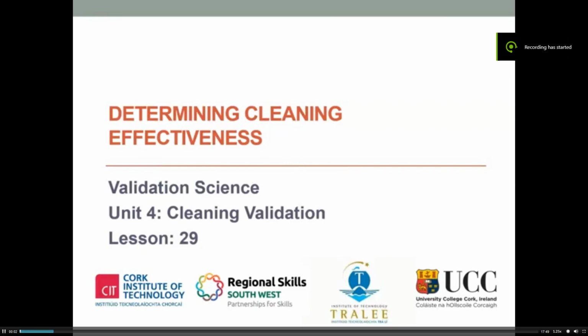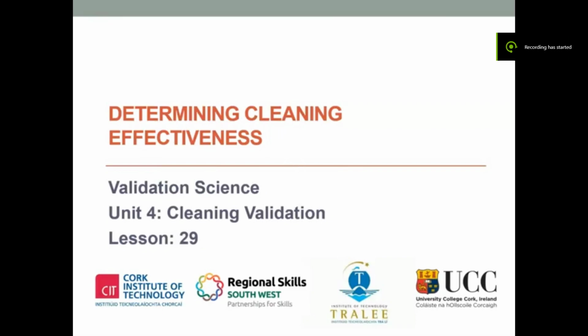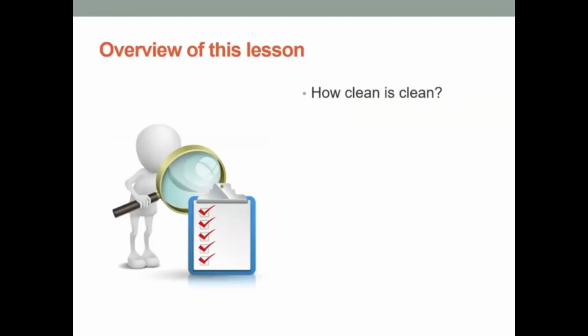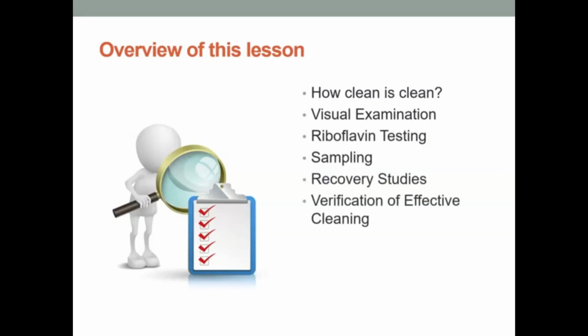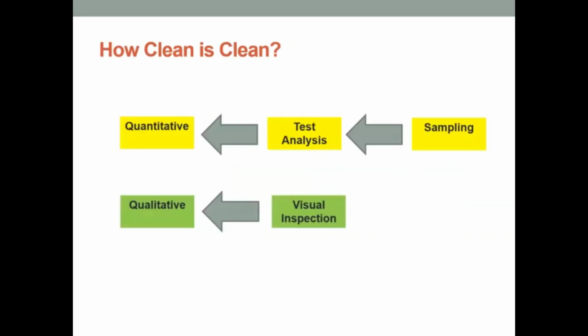Welcome to lesson 29, Determining Cleaning Effectiveness. In this lesson, we are going to be looking at how clean is clean, visual examinations, riboflavin testing, sampling, recovery studies, verification of effective cleaning.